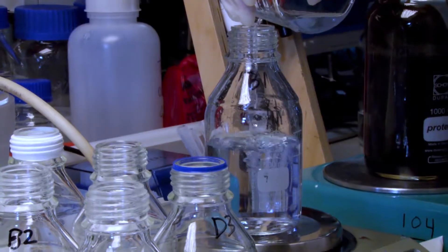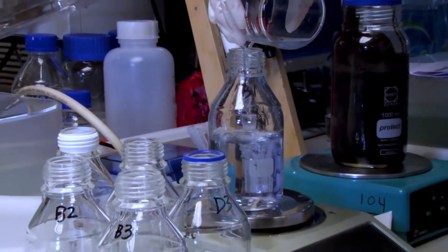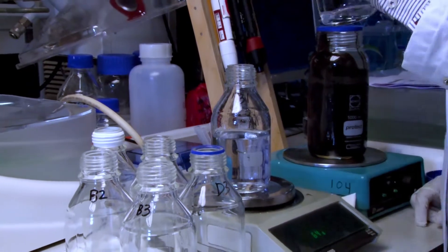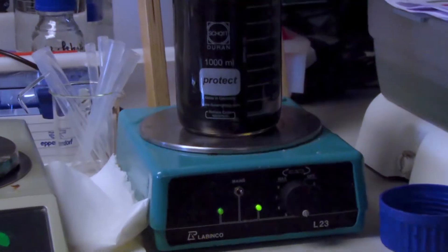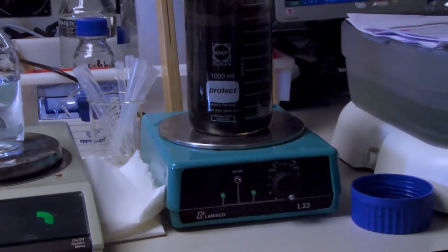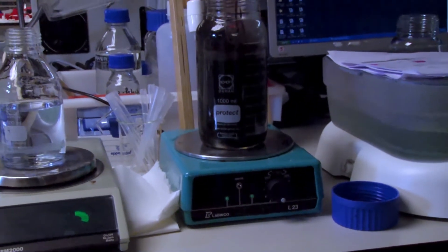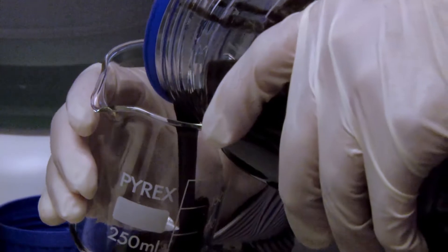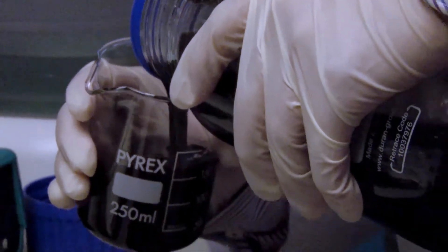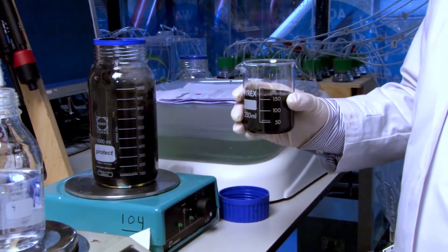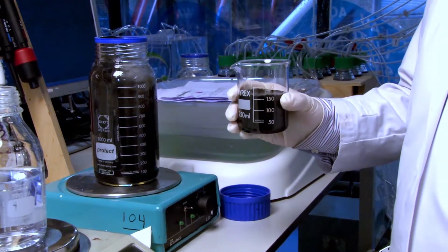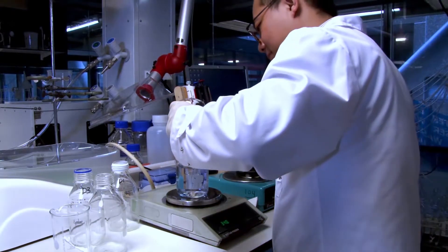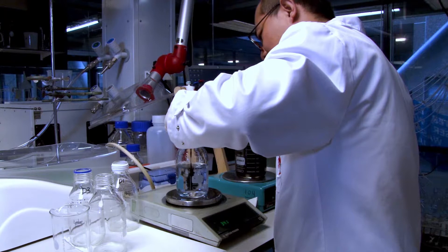For the blanks, using a balance, first weigh and fill the bottle with the calculated amount of media. Weigh and fill the bottle with the calculated amount of sludge to be tested. Prepare the other two bottles of the blank group in the same way.